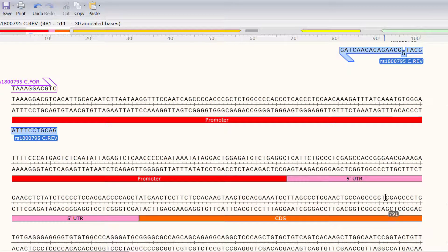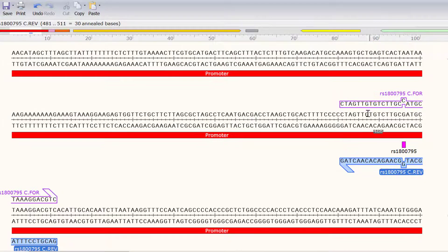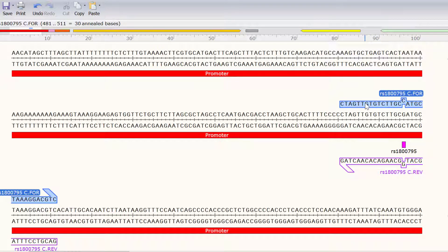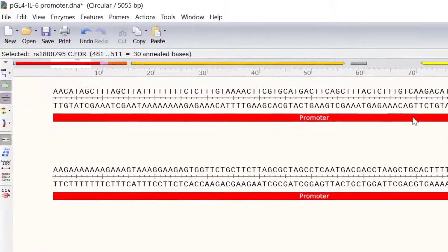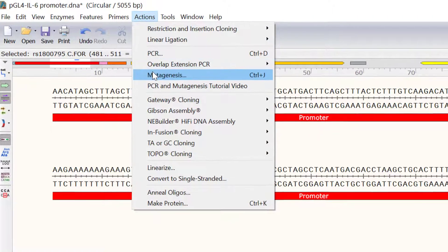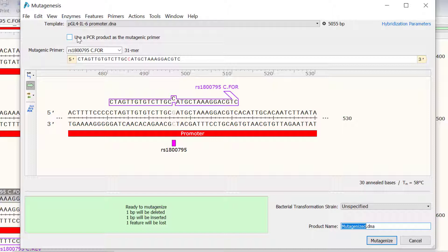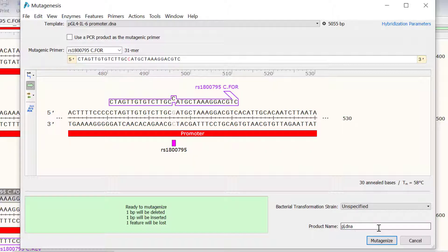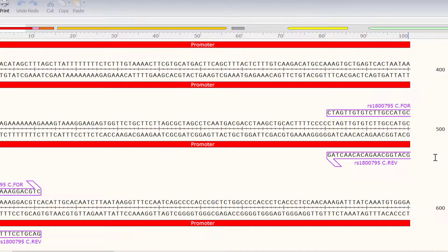To simulate the mutagenesis reaction, I will select one of the mutagenic primers, and then go to Actions Mutagenesis. All I need to do in the new window is to edit the name of the mutagenized plasmid. I will call this one PGL4 IL6 Promoter C Allele. Then I will click Mutagenize to create the new file.